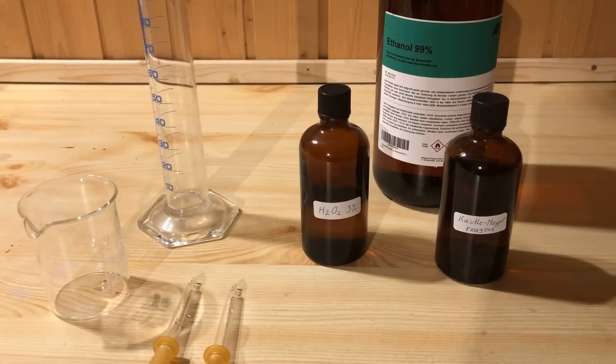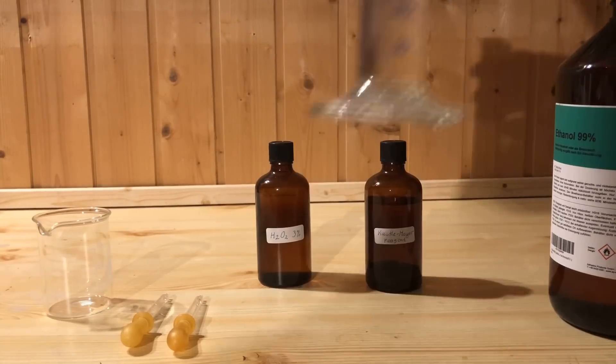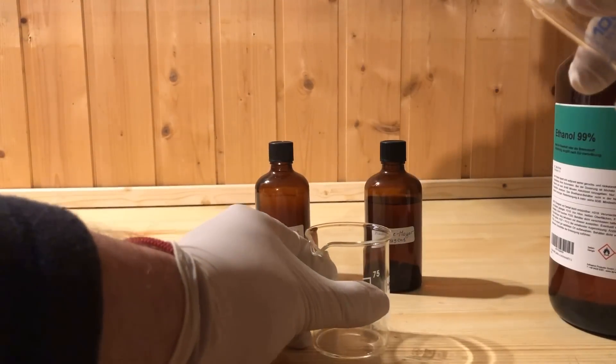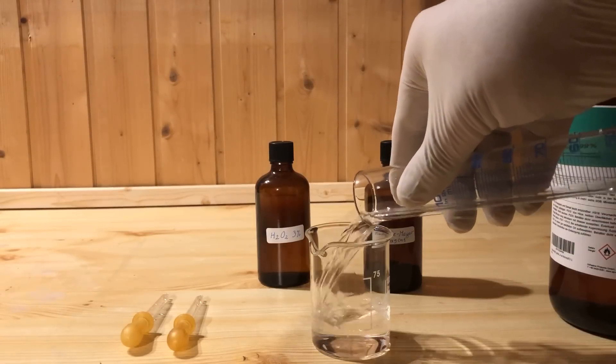For testing, 10 ml of the reduced phenolphthalein solution is mixed with 40 ml of ethanol. A 3% hydrogen peroxide solution is also prepared.